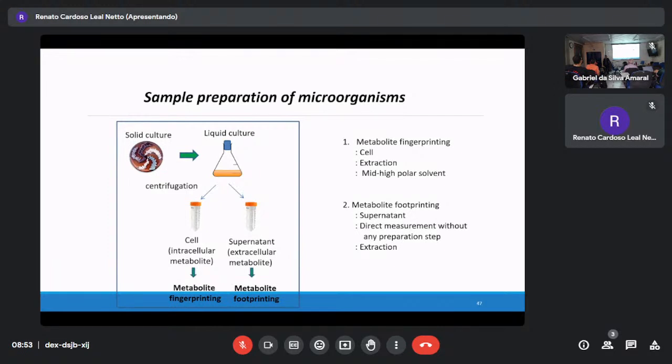Extraction. Ethyl acetate extraction means it's not only the excreted metabolites. Of course some people use solid phase extraction, but it is still a problem. You wash with water, then methanol. For example, streptomycin is a very water soluble compound, so it is easily lost in the water fraction. In solid phase extraction, the first fraction comes together with the media amino acids, and streptomycin is decreased.